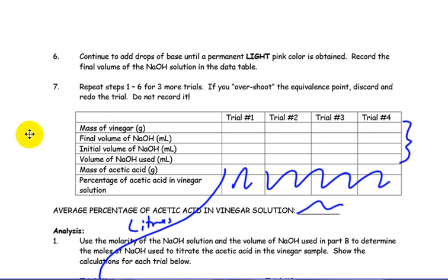So we're looking for 4 good trials here. So if you run out of room here, you may have to set up a trial here. Doesn't matter. Don't worry about the bottom 2 parts here and this part, because what we'll do is we'll simply answer it in the following questions here.